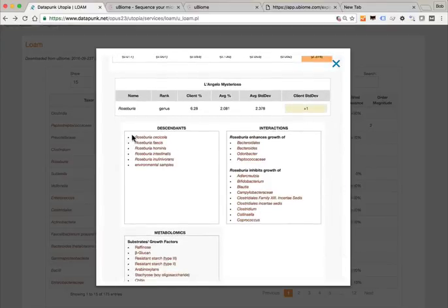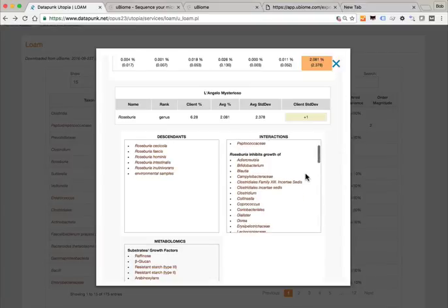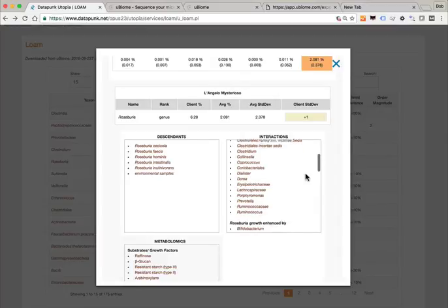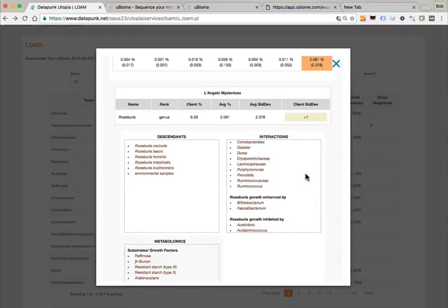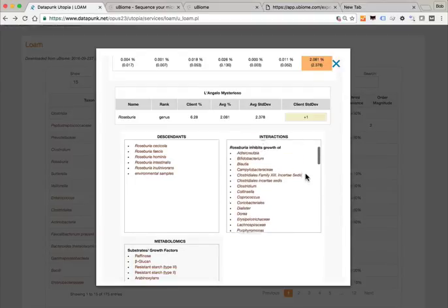Everything in the microbial world is hierarchical, so since we clicked on a genus we're getting all the descendants which are the species. We also get information on interaction webs. Studies have been done with linear matrix correlation data, and we understand that for many bacteria taxons we have inhibition and enhancement data. Roseburia tends to enhance the growth of certain species, but the presence of Roseburia in large amounts actually tends to inhibit other species. What Roseburia does is not necessarily the same as what's done to Roseburia.